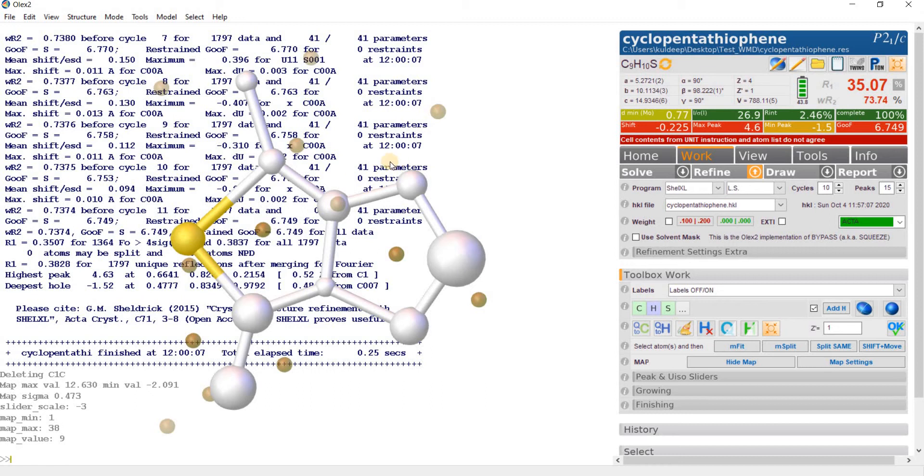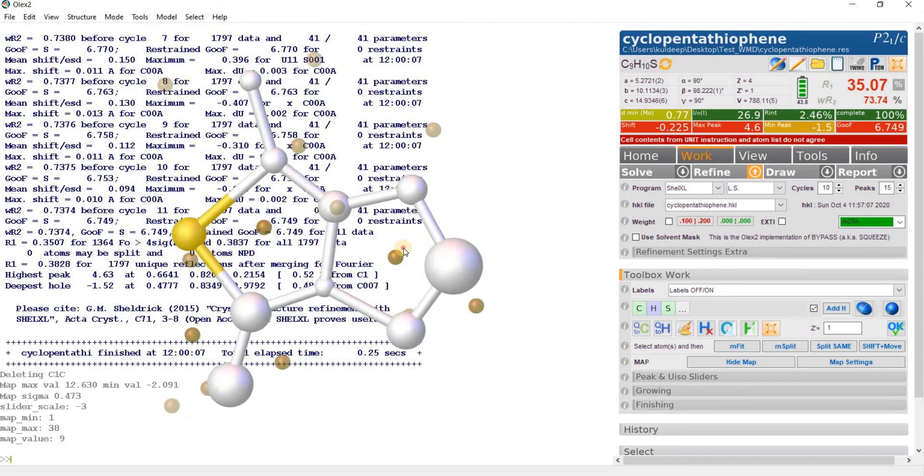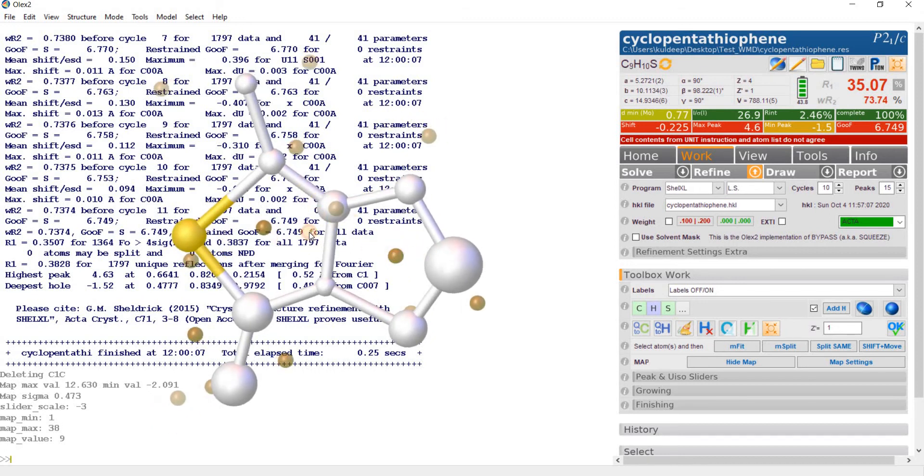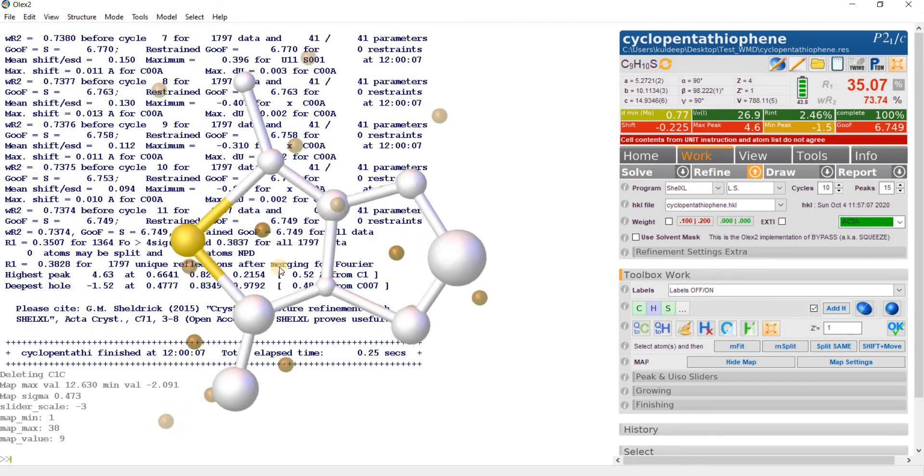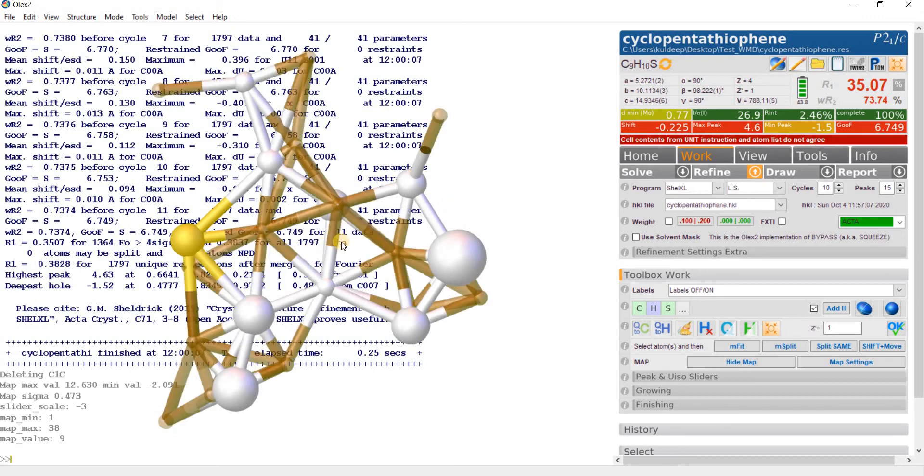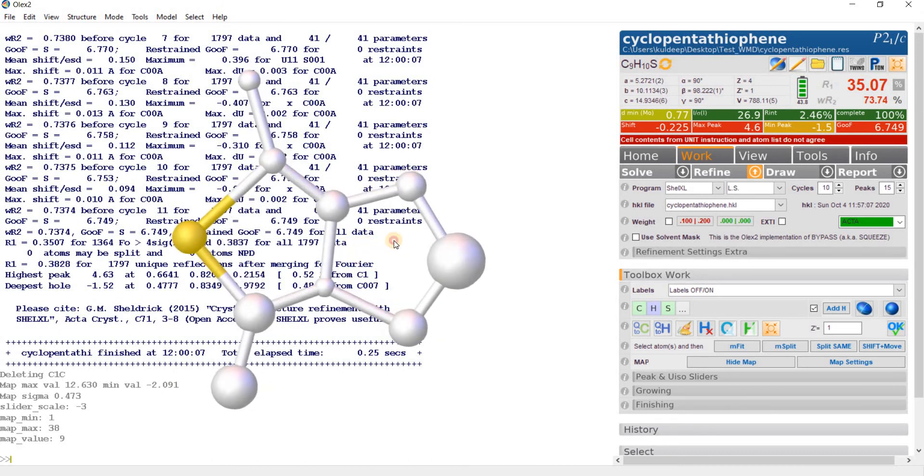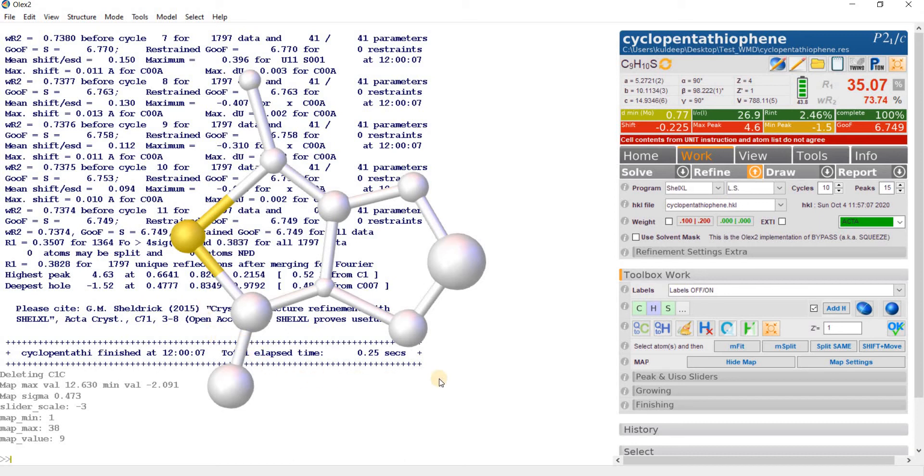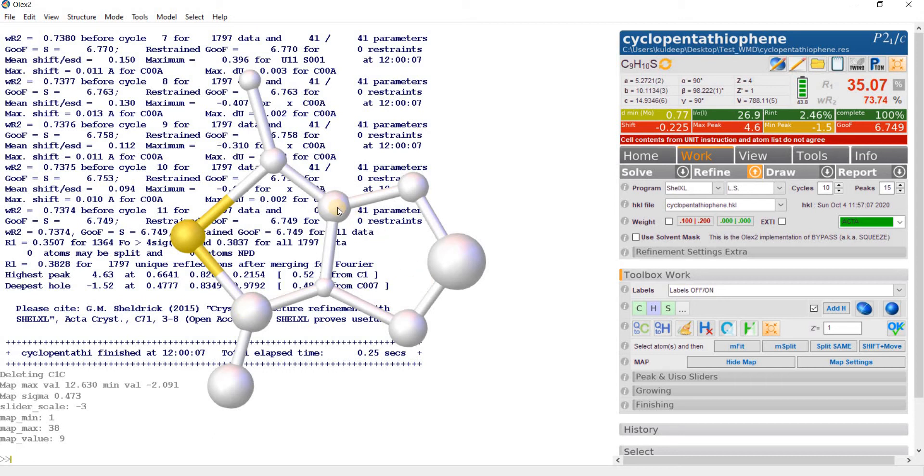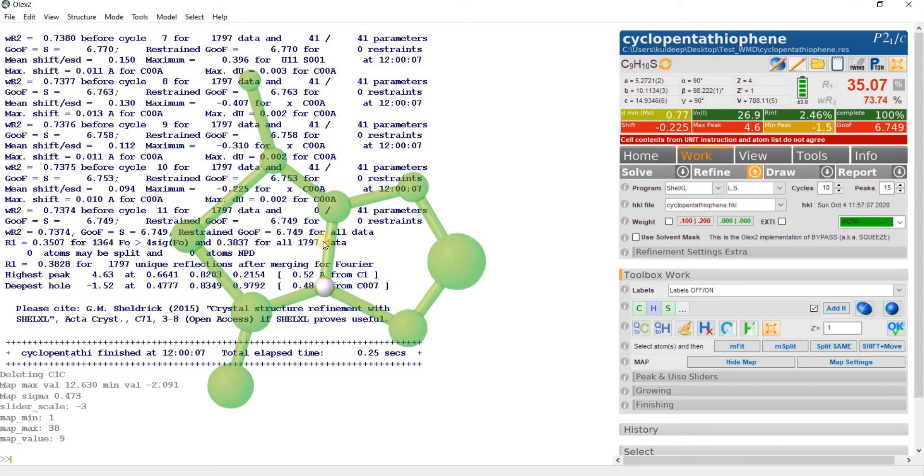We have to assign this electron density. Press Control+M again. If you carefully examine the electron density map, you will find that this carbon atom C007 in part is appearing at the position of Q3. This carbon atom C008 in part is appearing at Q5. And this carbon C005 in part is appearing on Q9. So we can say that the whole molecule is disordered.